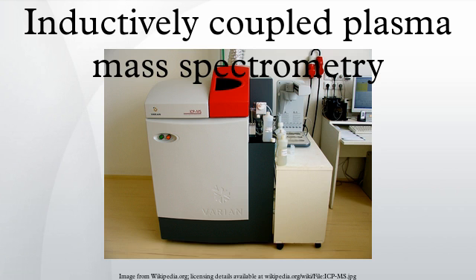Other methods of sample introduction are also utilized. Electrothermal vaporization and in-torch vaporization use hot surfaces to vaporize samples for introduction. These can use very small amounts of liquids, solids, or slurries. Other methods like vapor generation are also known.